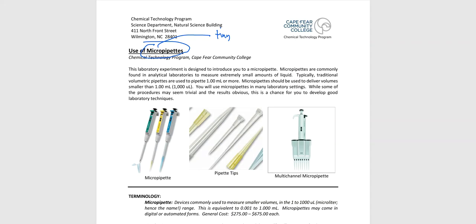So I want you to go back and think about the volumetric pipette lab that we already did. You probably said, oh, 25 milliliters volumetric pipette, and then 10 milliliters, and 5 milliliters, and then you probably got to one that was 0.7, and you tried 0.7, and you tried 0.7 again, and you're like, darn it, I can't get this one to work, it's too touchy.